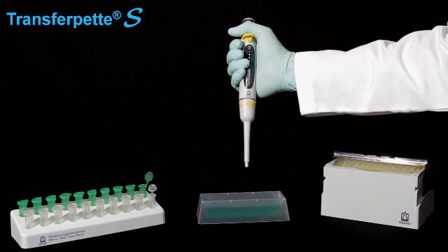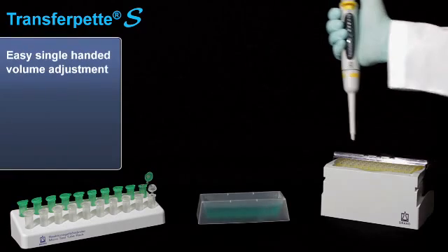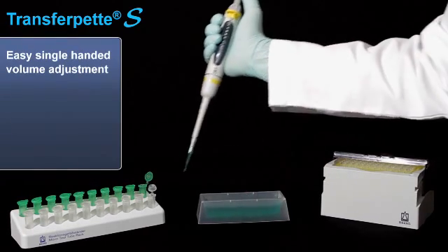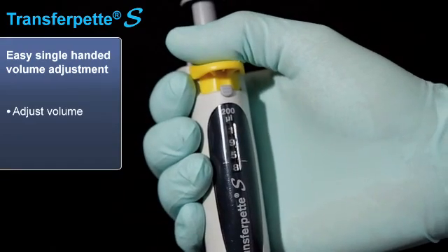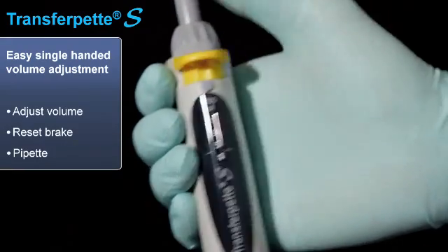The TransferPet S truly shines when in operation. Single-handed volume adjustments while wearing gloves makes all of your pipetting operations easier and faster. Simply raise the brake, adjust the display to your desired volume, reset the brake, and pipette.